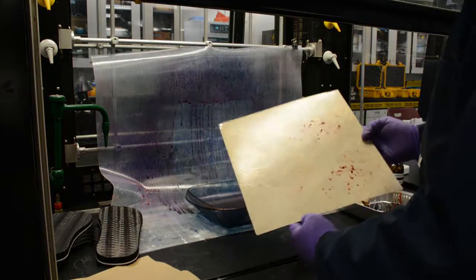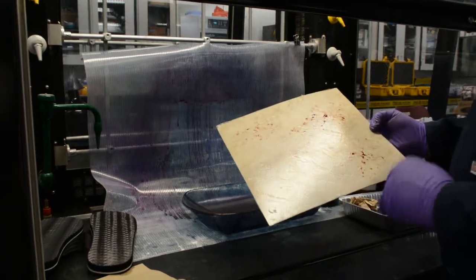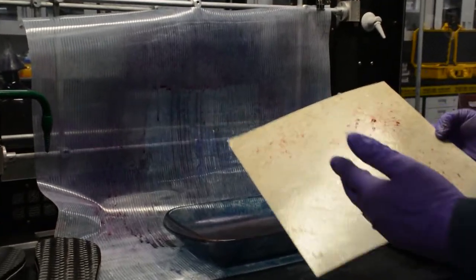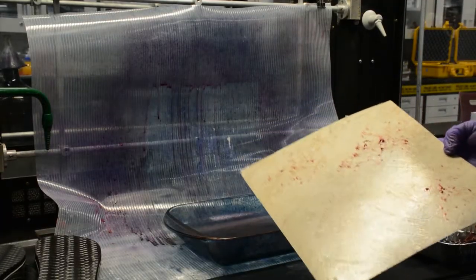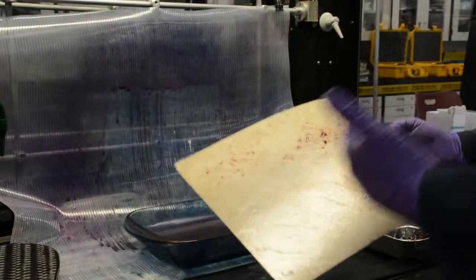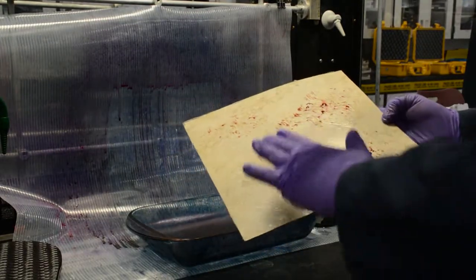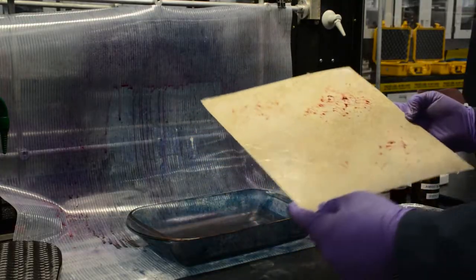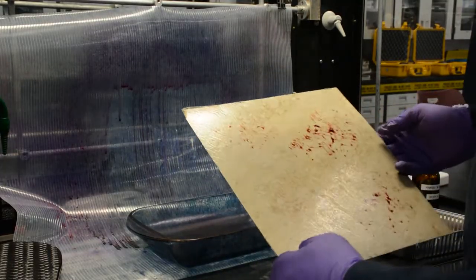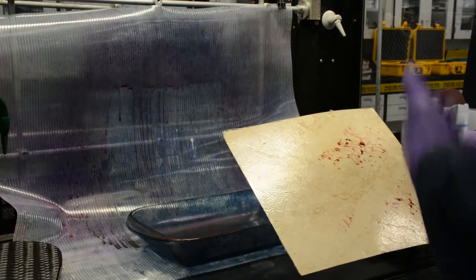Okay, so we've let it dry for several minutes now. There are still some puddling areas that we're probably going to see when we spray the Amido Black. Similarly to the Hungarian red, it's probably going to interfere with the development. It's in the more trace areas, where it's just slightly visible or latent, that we're going to find a much stronger reaction.